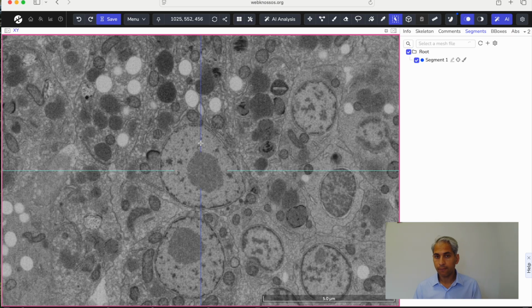Before moving forward, it's very important that we organize the work we're doing throughout the semester. And so I'm going to take a pause from annotating and go to data organization. When we did our first click, this appeared in the side panel. And if you rewind and start again, you'll see that this appeared the moment I did that first click.